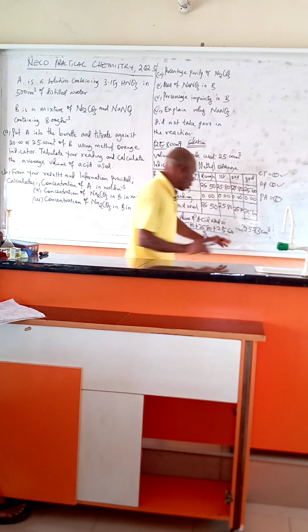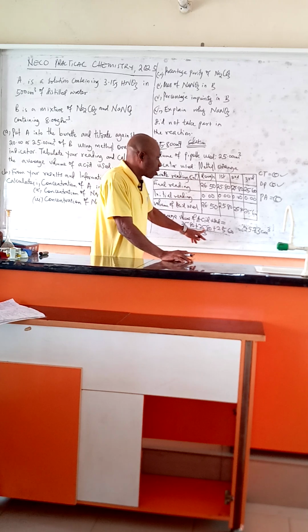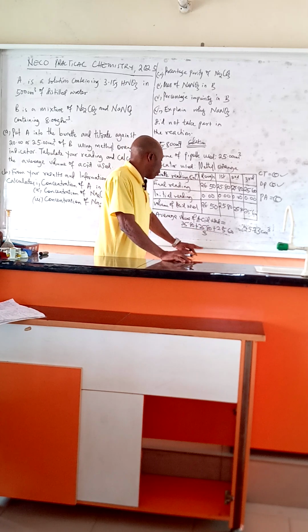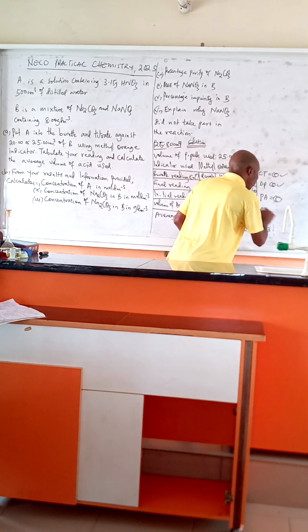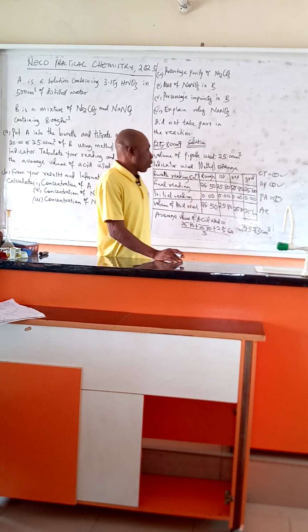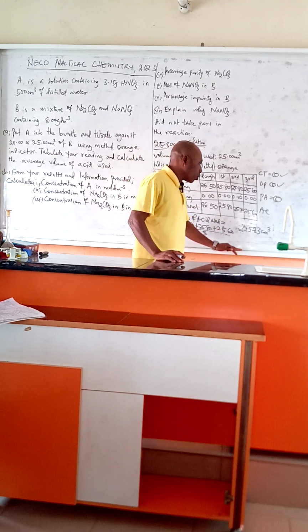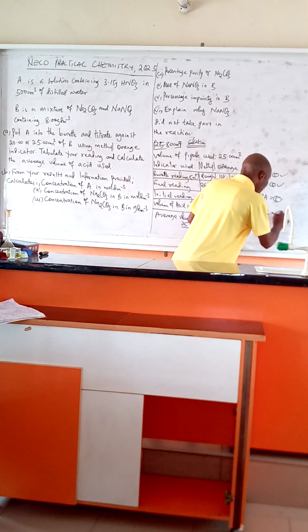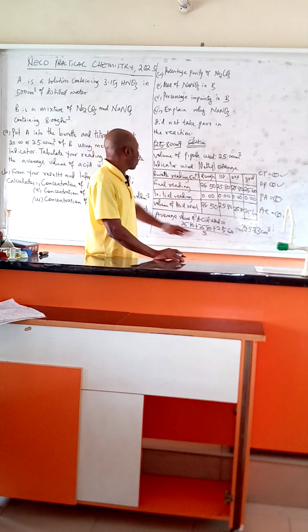Because we selected the best 3 that are concordant or consistent, and you get your average volume of the acid used, that will give you 5 marks. The accuracy of titration, AC. We know that the endpoint is within the accurate range, and that will also give us 5 marks. Now the application of these values in solving problem.